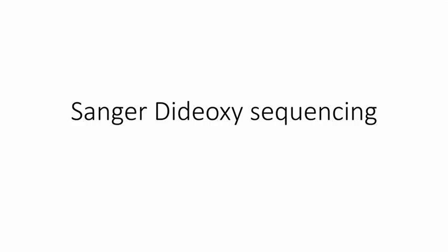Sanger dideoxy sequencing is a sequencing method that is still used today, pretty much in the same fashion from when it was first designed, with some updates. This lecture will discuss the original as well as the updates.